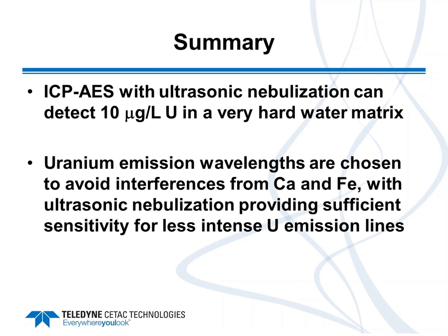And again, other things I'll point out about the ARIDIS II versus the ultrasonic. The ARIDIS is typically self-aspirated and uses a lower flow, anywhere from 50 to 200 microliters per minute. The ultrasonic nebulizer, you do have to pump the sample to the transducer. It can't be self-aspirated.